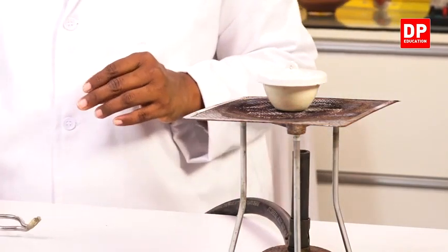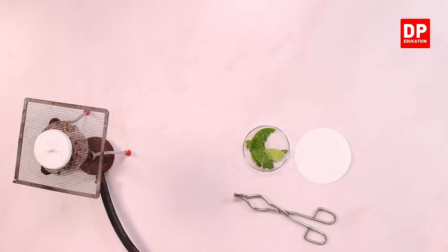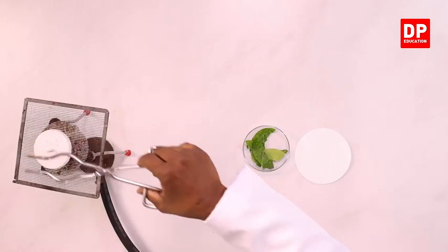While it is getting heated up, we will have to remove the lid on and off so that the water that is vaporizing from the leaves will be removed. I will remove the lid on and off. You can see the water vapor coming out. Again close the lid.